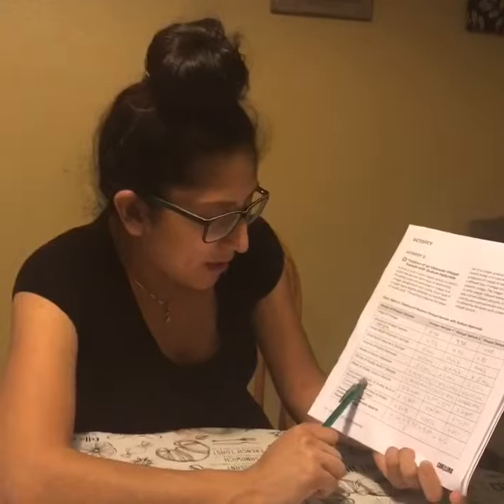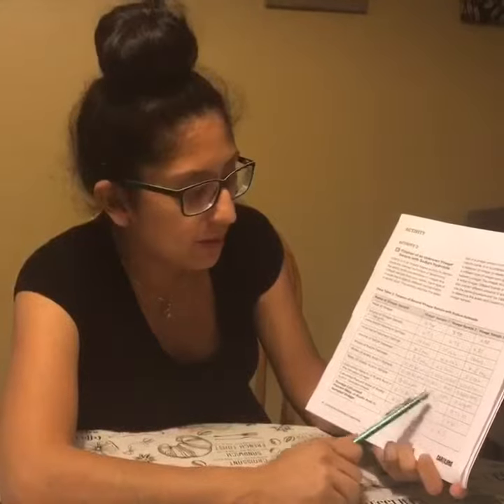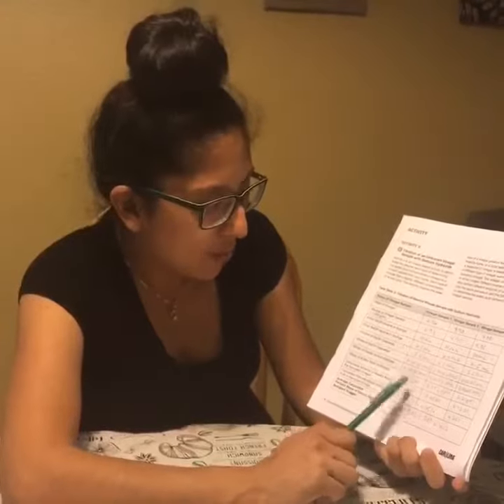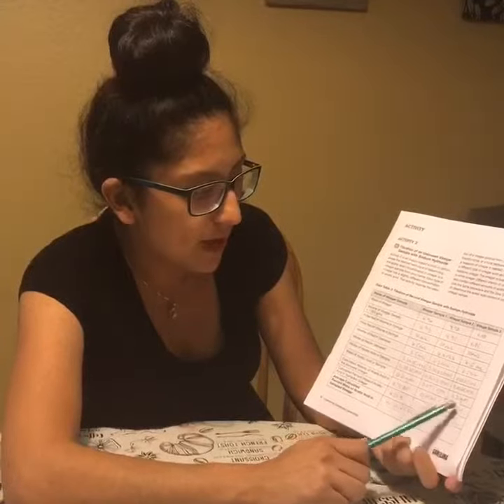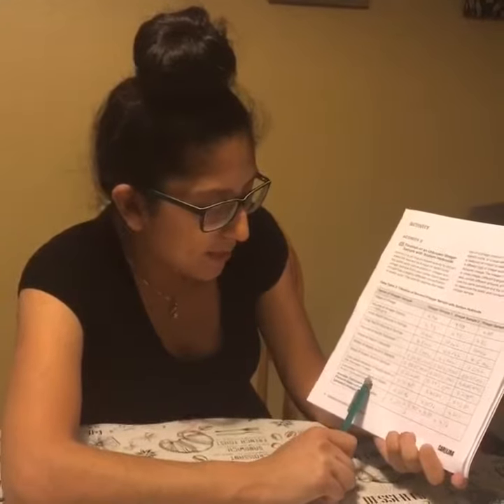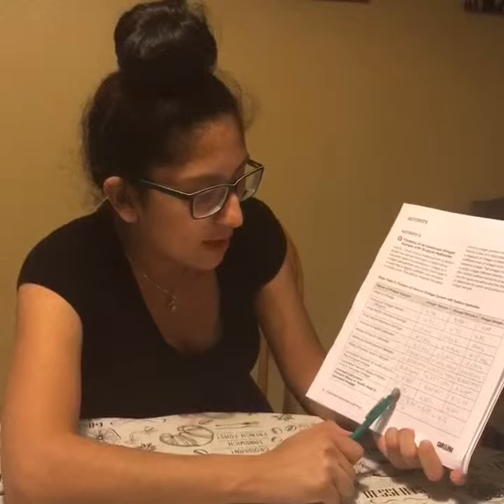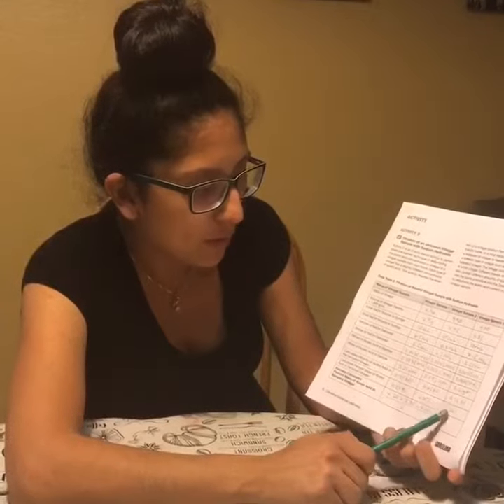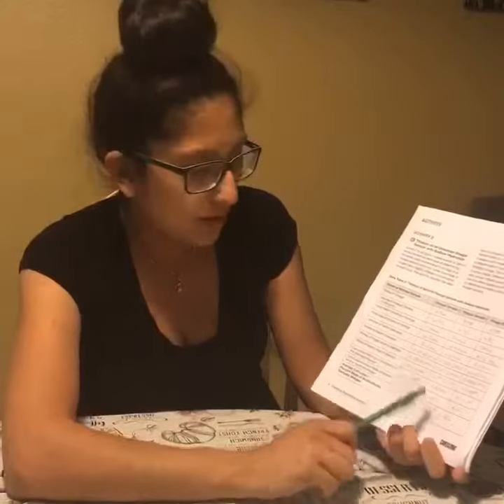The calculated molarity, around the same. All 3 of them had different numbers. Sample 1 0.71, sample 2 0.65, and sample 3 0.72. The calculated percent mass was around, again, the same. 4.23, 3.85, and 4.30. All of them were around the same.